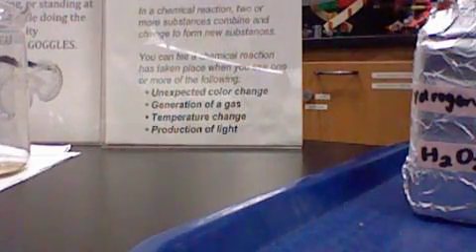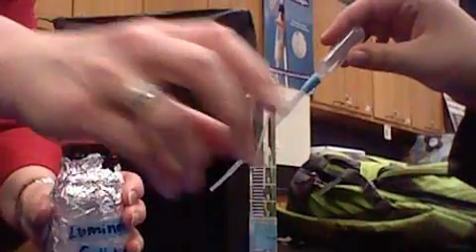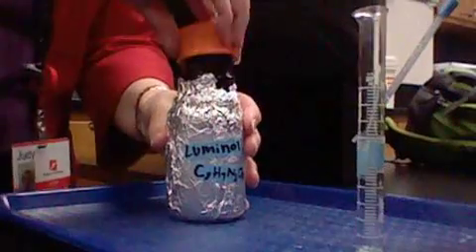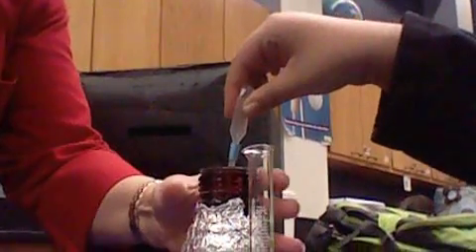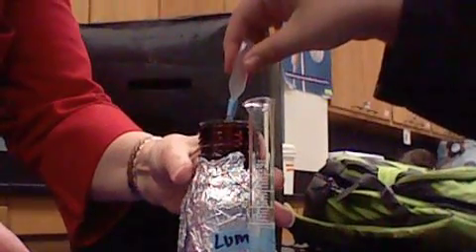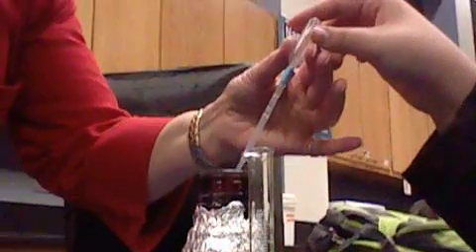This one is the luminol, so I think I asked you to do this. We're going to do this together. So just squeeze it and release. Okay. I want you to fill this up to the bottom of that blue line, all right? So squeeze it first before you dip, then dip all the way in. Now, don't squeeze it again because then you squeeze it all out.